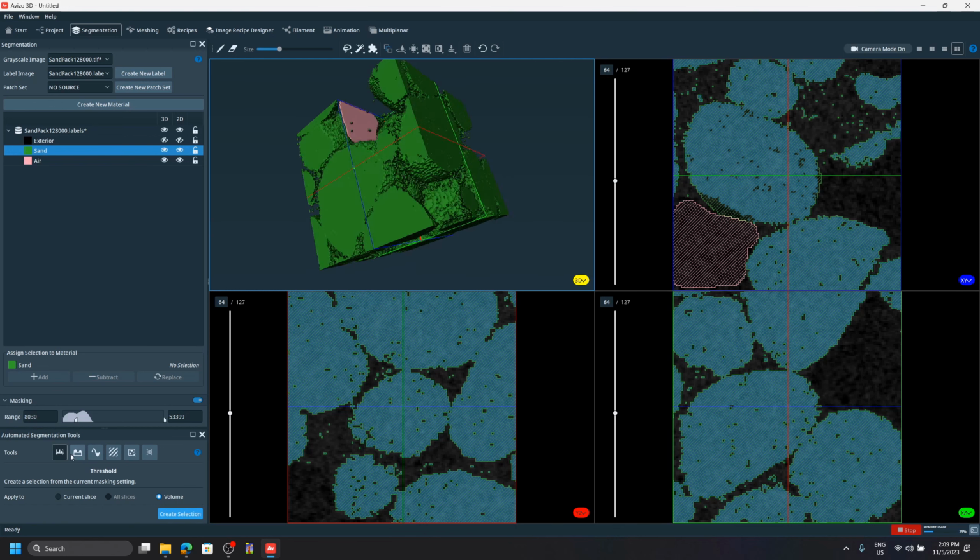Okay, so I will not go through the other tools because we've gone through them before in past image segmentation workshops. And if you're interested in taking a look, you can just search in YouTube for KAUST Visualization Core Lab. We have the recordings of those workshops from before, okay?